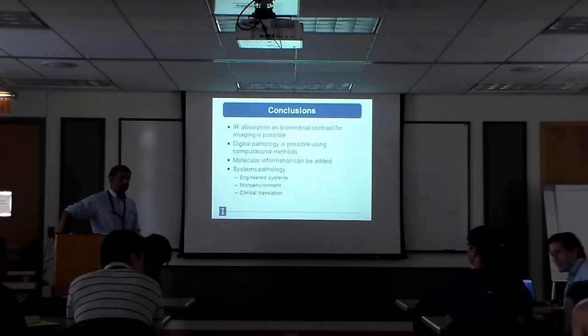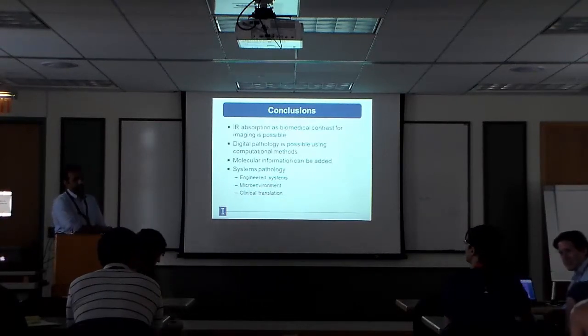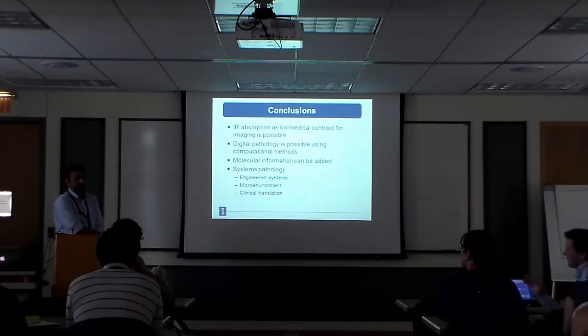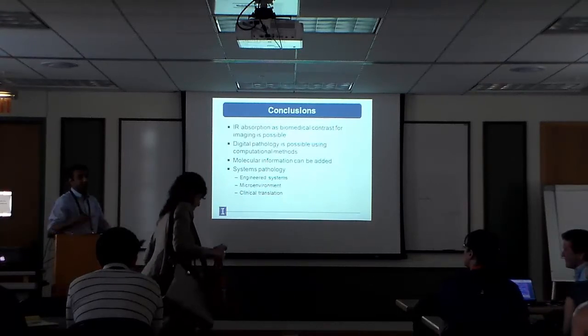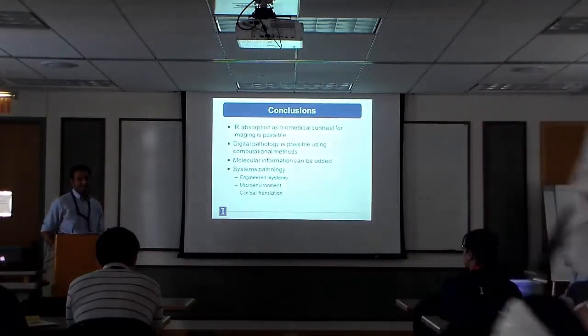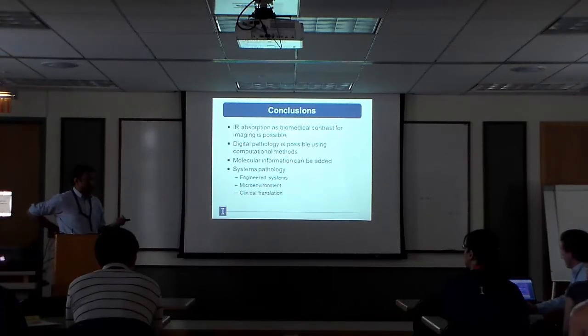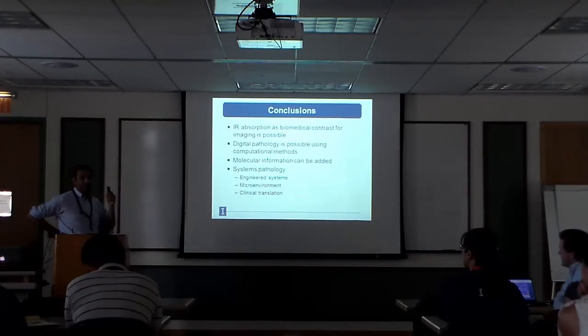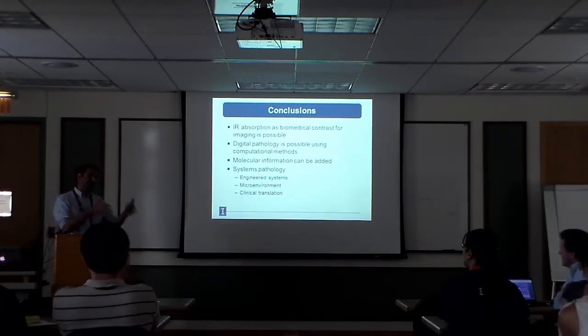Is it possible to use just an algorithm to reduce the dimension and get the same? Yeah, you're absolutely right. In 2007 or so, the standard in the field was that people would just use PCA, right? Would just do principal components analysis, transform the whole thing, figure things out. And when we wrote our paper in 2007 saying that's idiotic, the reviewers were not happy at all. They just beat down on that thing and said it's not possible that you're taking information that is not contained in the PCA.